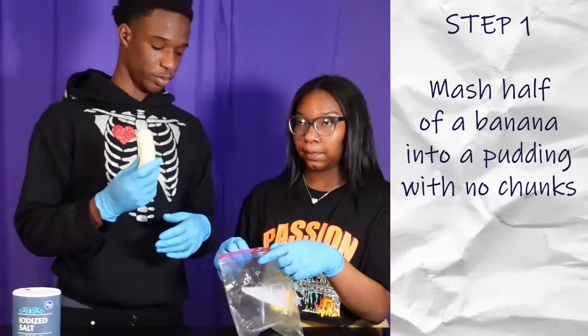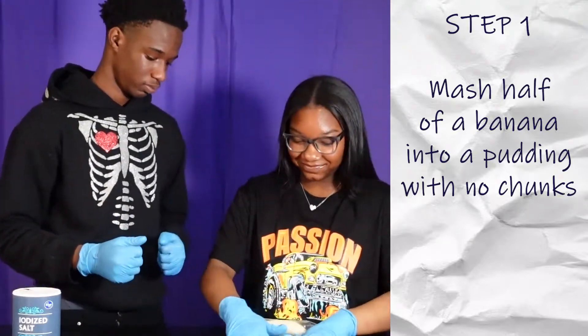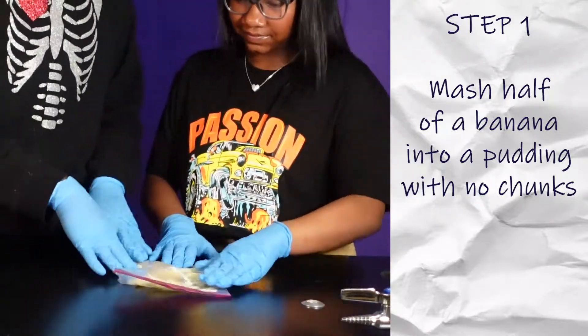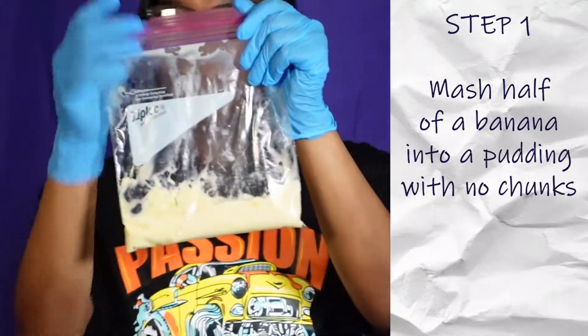We put half of a banana in a bag and mush it until it becomes like a pudding. It feels like a pudding — there are no chunks of banana pieces in here, it's just all soft.